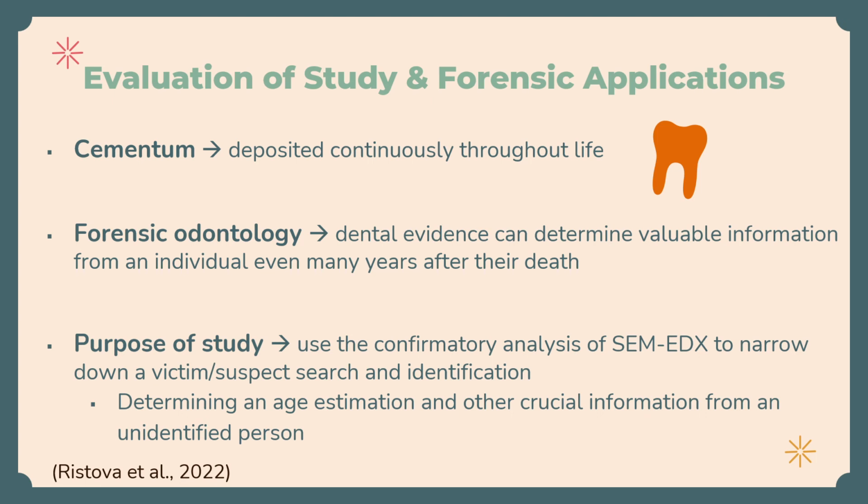The purpose of this study, and why I chose it, was that it used the confirmatory analysis of SEM EDX to narrow down victim or suspect searches and identification by determining age estimation and other vital details from unidentified people.